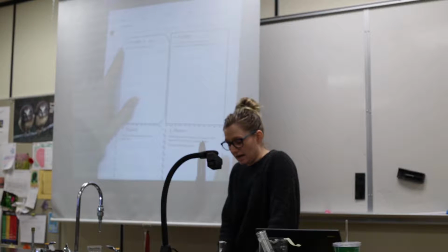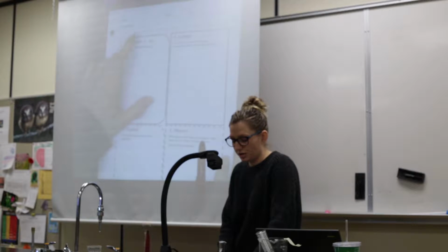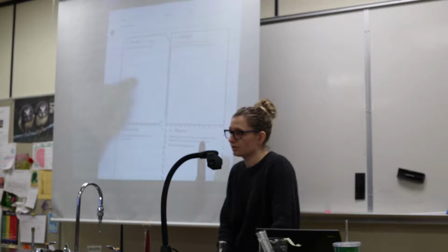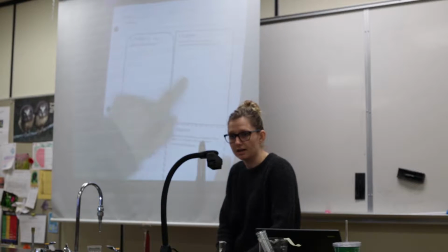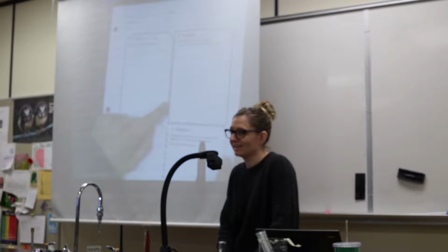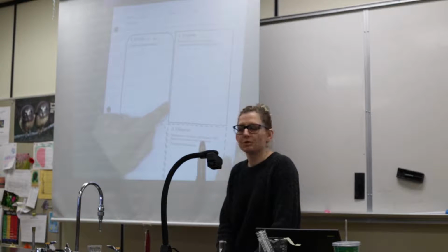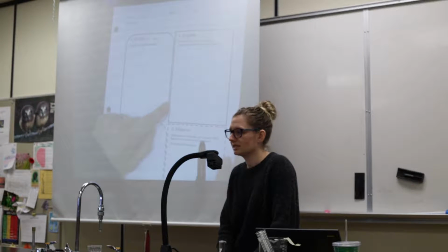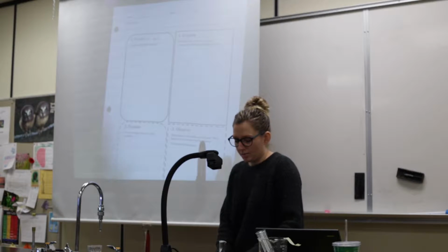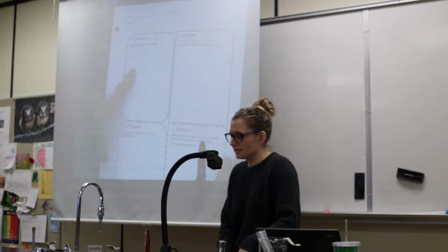You're going to get solution A, and you're going to do a hypothesis that involves heating. So if the solution is increased in heat, then make your prediction what's going to happen to that solution, right? Use your qualitative observation skills, which are what? Eyes, ears, touch. Eyes, ears, mouth, and nose. Which one do we absolutely not do? Taste. Okay? Do not taste anything today. So make your hypothesis, your if-then statement.